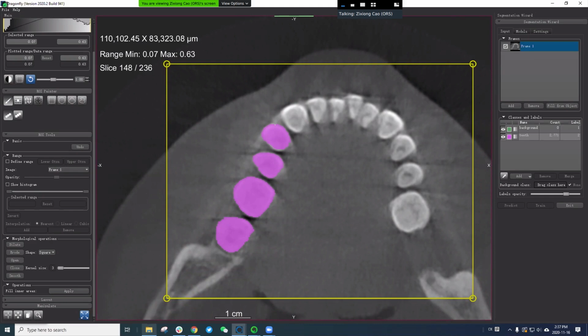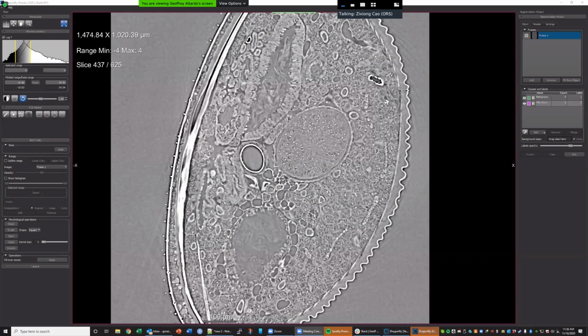Can we just do a quick screen sharing? Sure. I had a question. So to use previously generated or manually annotated features, how do you bring those into the wizard? Yes, we do have a tool for that.